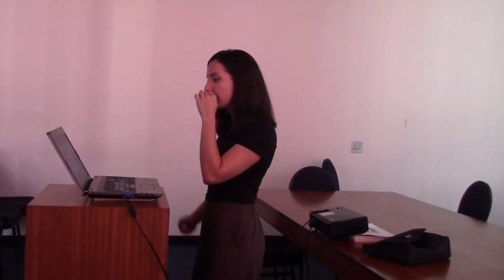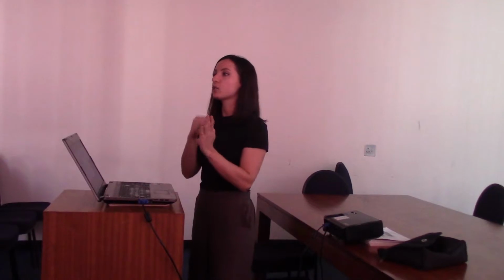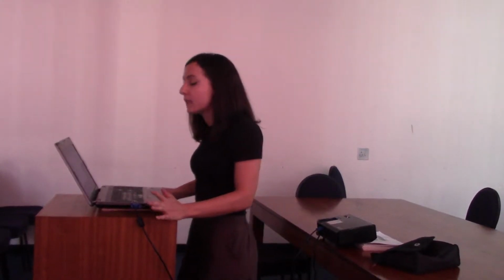After you've done your RNA isolation, say you've done poly-A selection, you're going to convert to complementary DNA, so it's reverse transcribed, and then you need to do sequence purification and just removing low quality sequences. So at each of these steps, you could be introducing errors, and it's very similar to any of these proteomics assays that we do. And it's always good to read around, understand where you're introducing problems into your workflow. Finally, then you're going to use any next-generation sequencing platform, and that is entirely up to you. There are a number of companies that now do this, that will now sequence your cDNA.